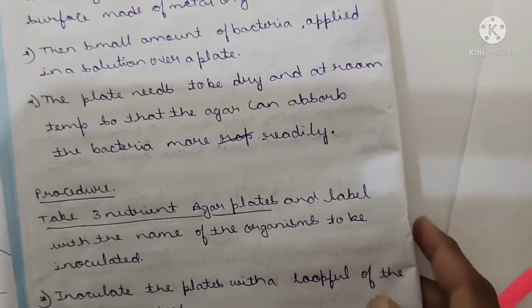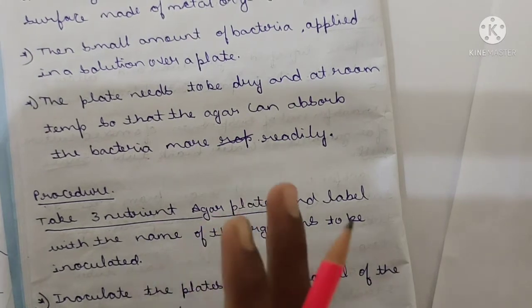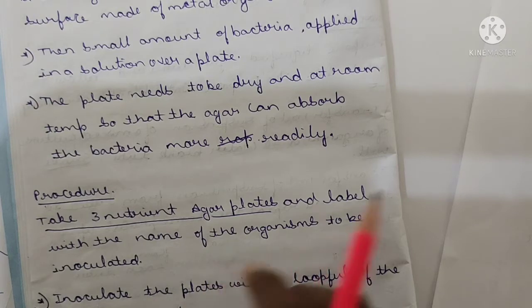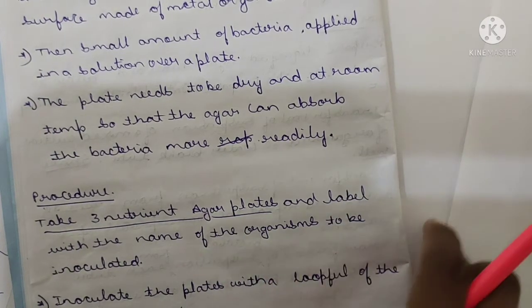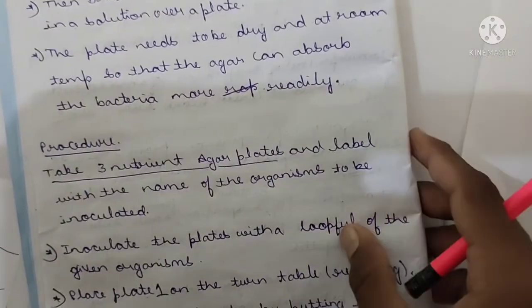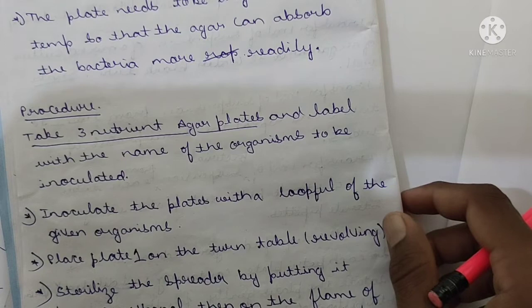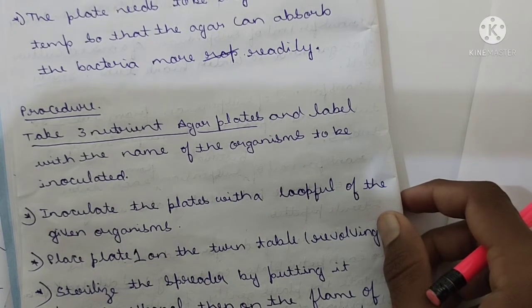Now procedure: take 3 nutrient agar plates and label them with the name of the organism to be inoculated. We have to take 3 nutrient agar plates. Okay, label them with their expected names. After labeling, inoculate the plates with a loopful of the given organism.